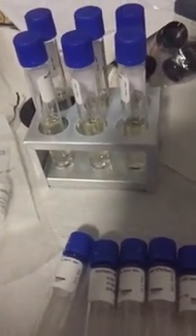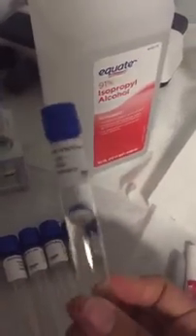And just like any of our experiments, we do need incubation periods after we instill the culture in the nutrient broths. One thing we need to remember is to sterilize all the tubes using our candle before we try to pipette our cultures in the broth to avoid cross-contamination and introducing other microorganisms in our experiment. So that's how we're gonna do this experiment, and I'll go to it now.